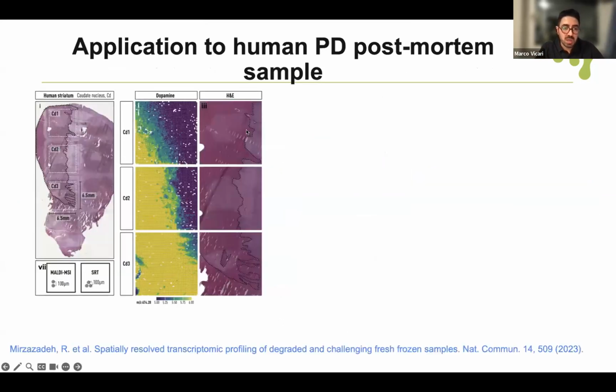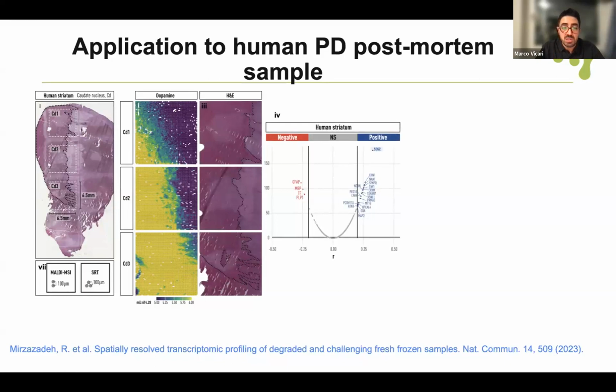Finally, we wanted to apply the very same strategy to a human postmortem sample. So this sample had been in our -80 freezers for more than 6 years. So we were expecting that the RNA was very highly degraded. And for this reason, we decided to apply a protocol that has been recently developed by our lab just to analyze samples with highly degraded RNA, which is cited below. And this kind of analysis gave very similar results.